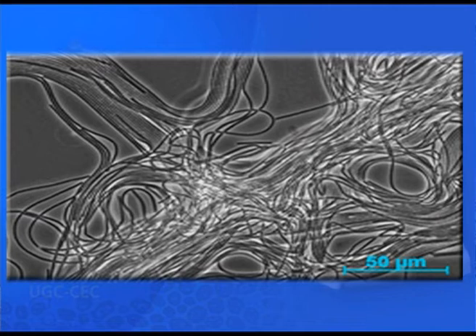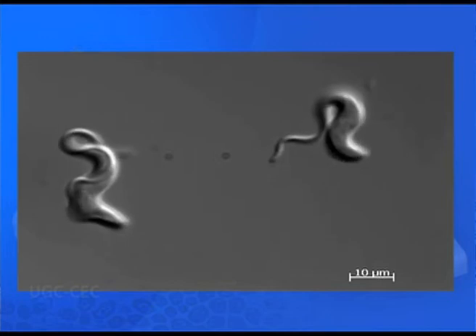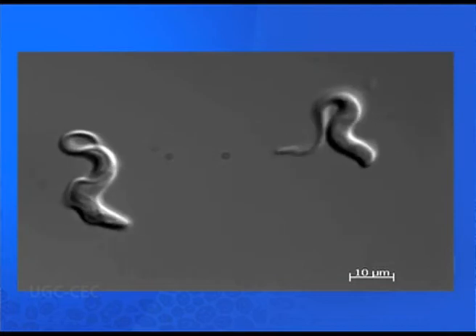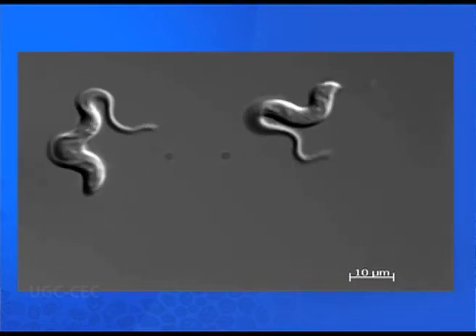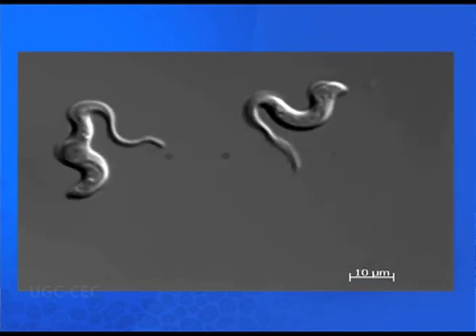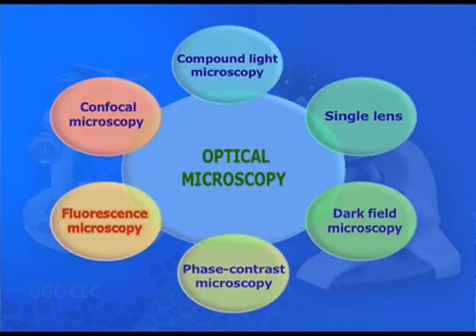Phase contrast microscopy is particularly important in biology as it reveals many cellular structures that are not visible with a simpler bright field microscope. Cellular structures were made visible to earlier microscopists by staining. This required additional preparation which killed the cells, as we have already discussed. Phase contrast microscopy made it possible for biologists to study live cells and how they proliferate through cell division.